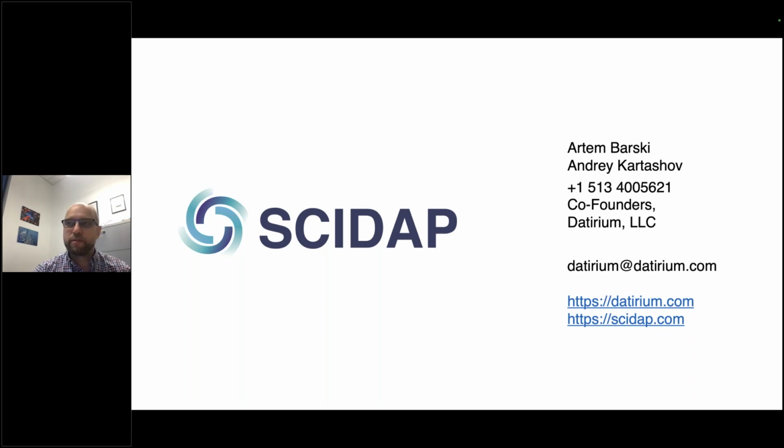Okay, one more question. How long does it take to run the analysis for a 10 sample experiment, for example? So it largely depends on the hardware that you are using. If you are using our cloud, it would likely take a couple hours to process initial samples, then a couple hours for integration, and then probably a couple hours for each of these pipelines. And since you are running them in turn, it would likely depend on how soon you start the next step after finishing the previous one.